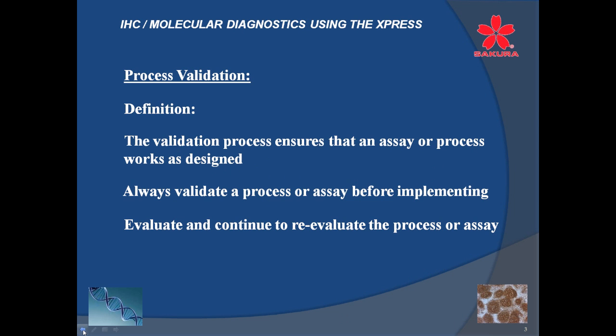So process validation, if we were to define this very briefly, the validation process will ensure that an assay or process will work as designed. I'm going to state this, and I'm not being critical of histotechnology or histotechs, but many of us who've come up through the histotechnology realm haven't always been very precise in some of our work.